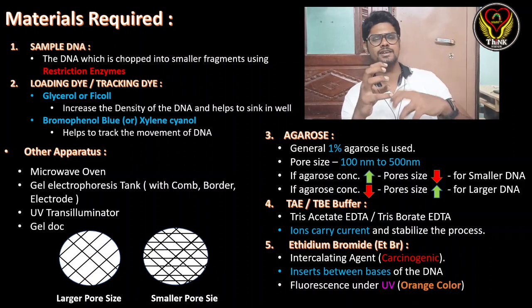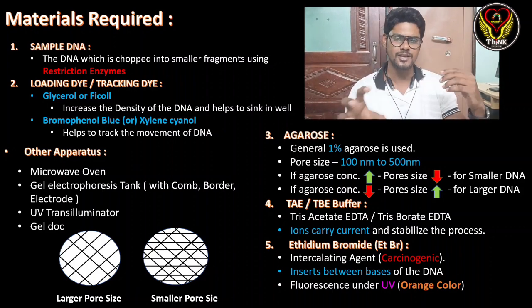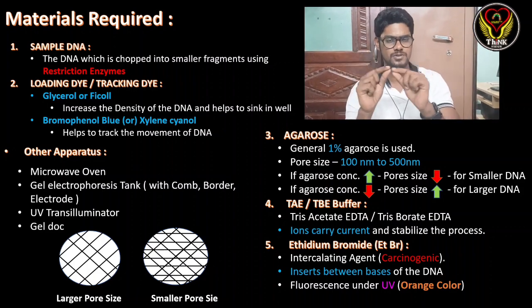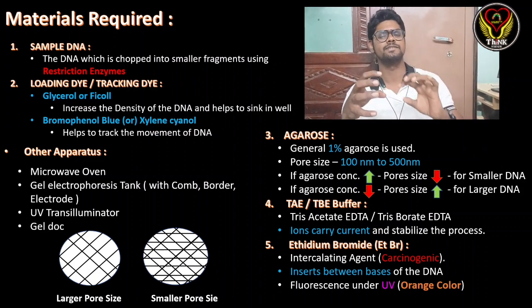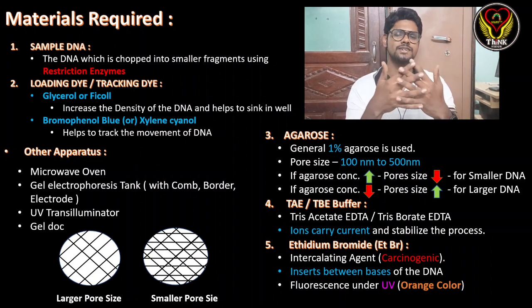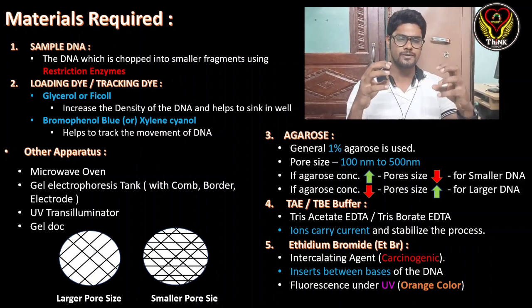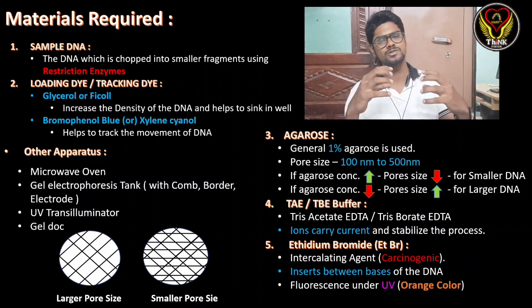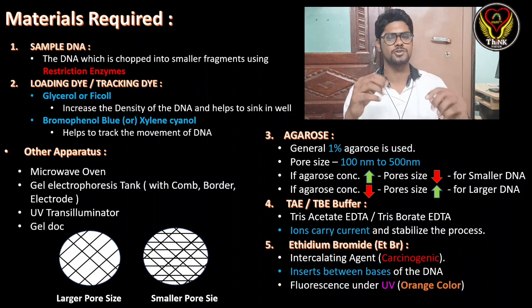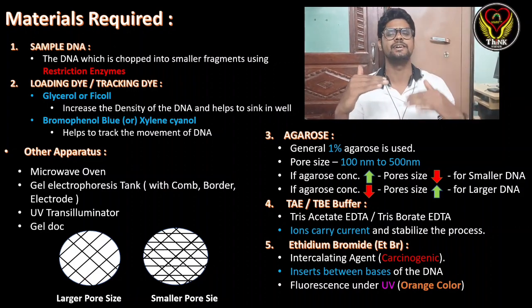So if you increase the concentration of the agarose, the pore size will decrease, because it will help to separate smaller DNA. If your DNA sizes are very small, you can increase the concentration of the agarose so that the pore size will be smaller and the smaller DNA will be separated. If your DNA samples are larger, then you can use a lower concentration of agarose so that the pore size will be a little bigger and you can separate larger DNA molecules.